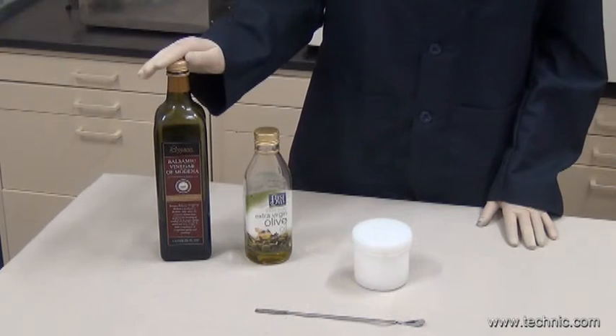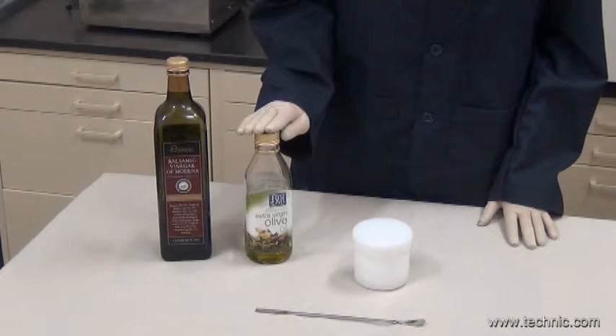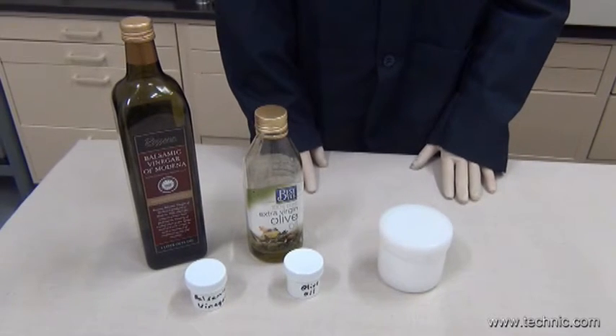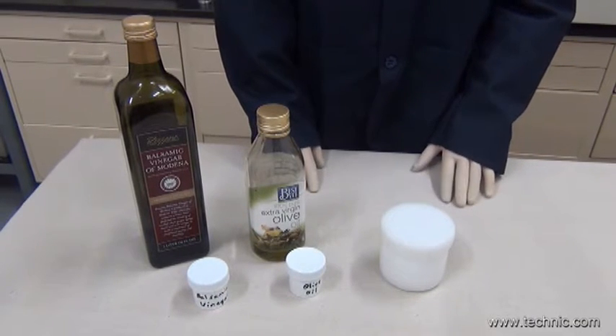Today we will demonstrate that the Zero Star can effectively mix two dissimilar liquid components. As you can see, we have some balsamic vinegar and some olive oil. We put the two liquids into a standard KK 250 container.